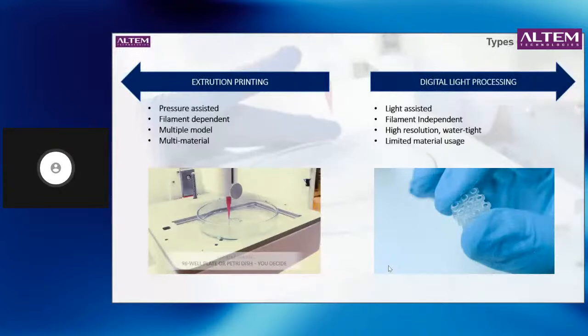So there has always been a lot of work done towards extrusion printing materials, but very limited work in terms of digital light processing based materials, because there is a correlation between the amount of light intensity, the material polymerization, as well as the cell viability. So these three factors have to play around when you're trying to print any form of material.